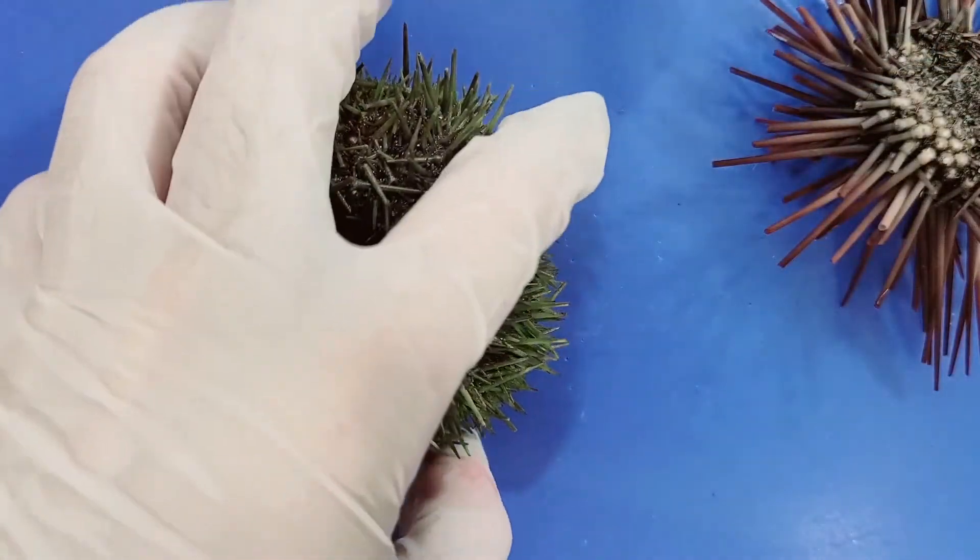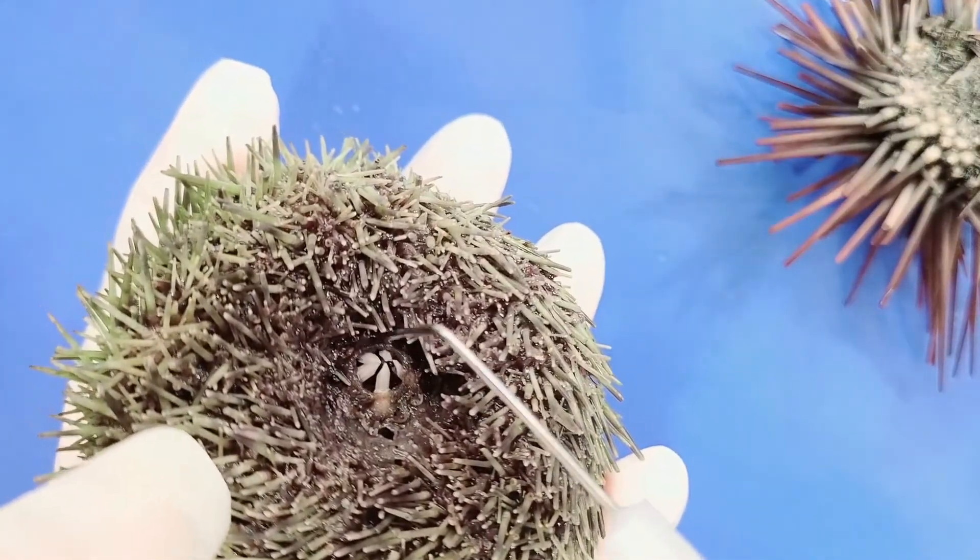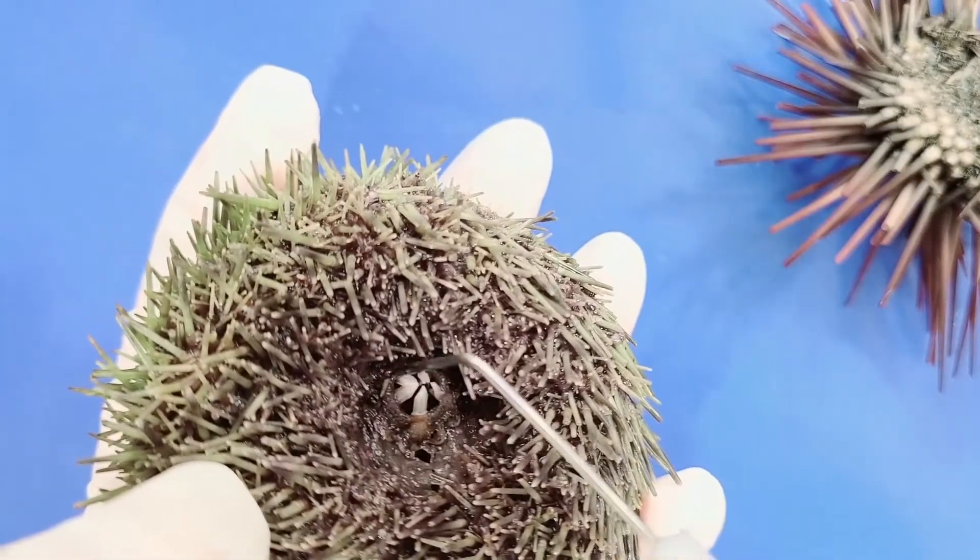On the green sea urchin, you can see the mouth here with five teeth arranged in a circle, and you can also see the peristome.